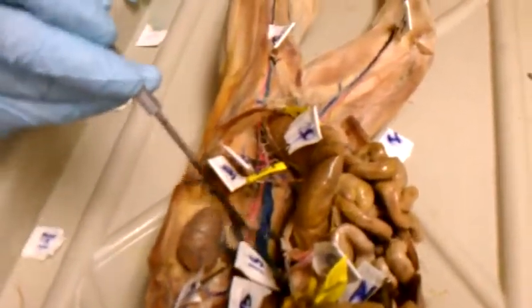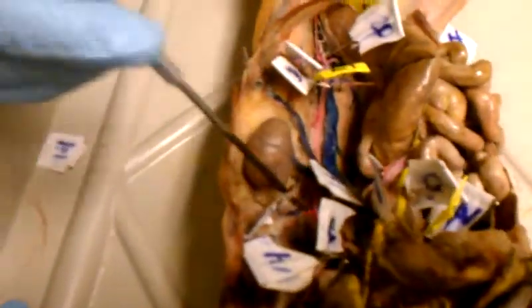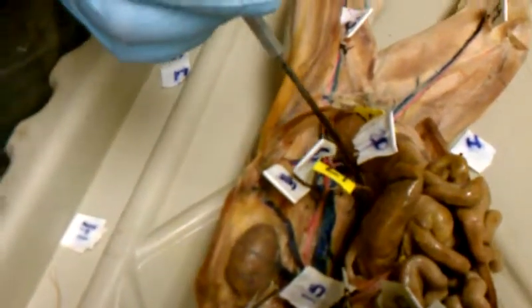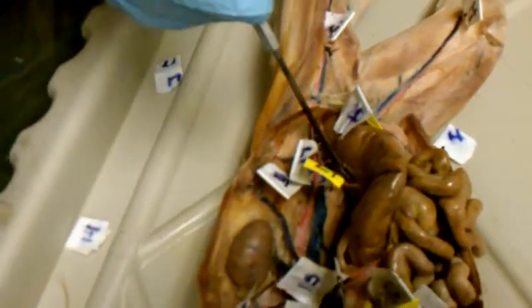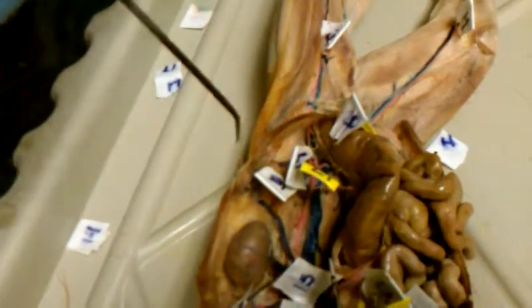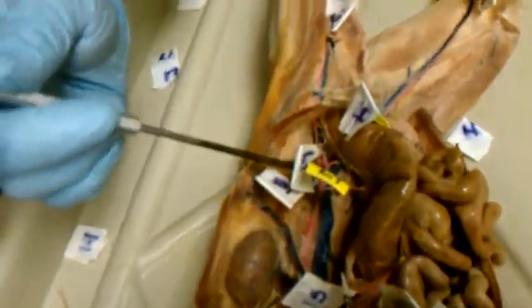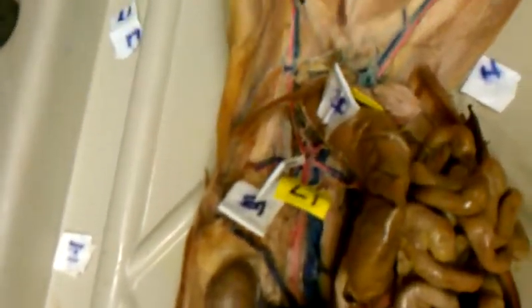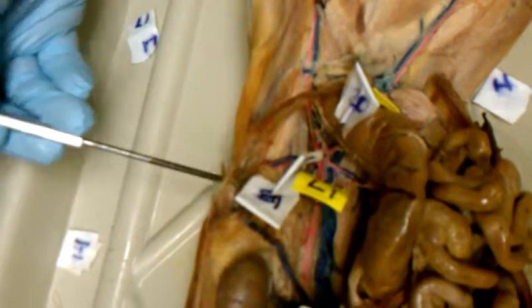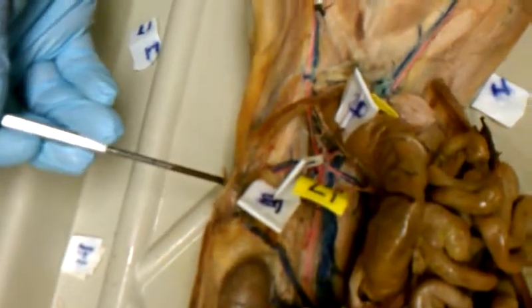Okay, this is the inferior vena cava. It kind of comes alongside the descending aorta. Going down, we have the inferior mesenteric, and it's thread-like. It's much smaller than the superior mesenteric, but you can tell it's mesenteric because it's connected to the guts. The next one is the iliolumbar. There's the iliolumbar artery and the iliolumbar vein, and they're branching off laterally. Notice a lot of them go medially. This is branching off laterally because it's going to come around to your hips and your lower back.